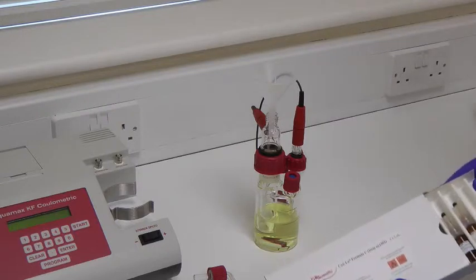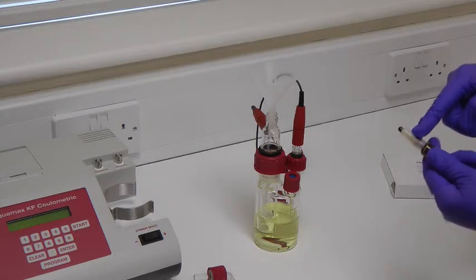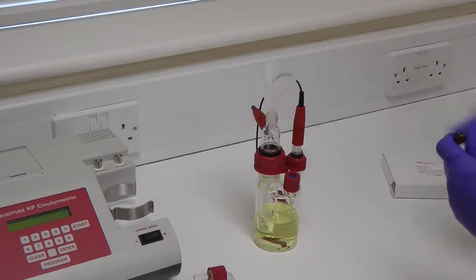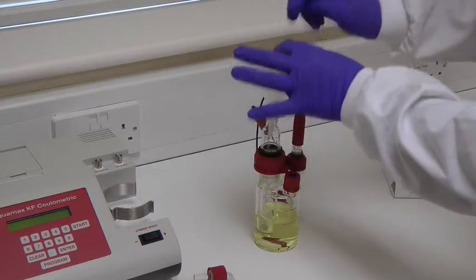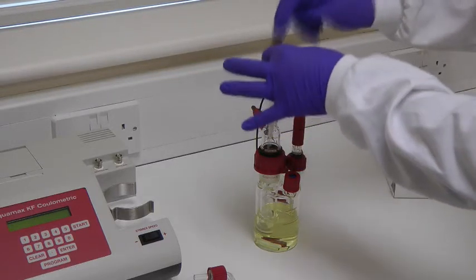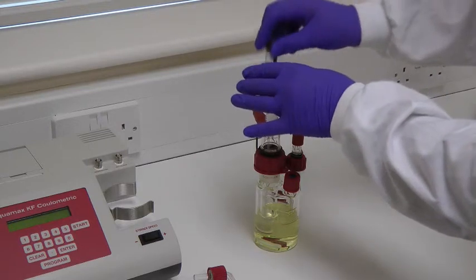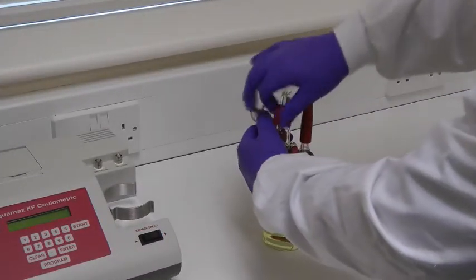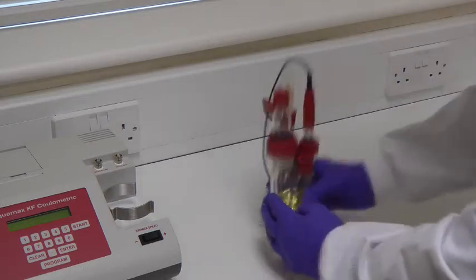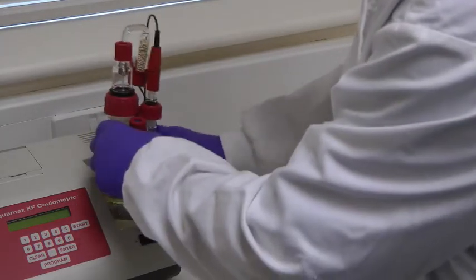Take the cathode reagent, snap the vial, which has a safety snapper already fitted, and pour the reagent into the inner chamber of the generator electrode. Reconnect the drying tube, relocate the glassware onto the Aquamax KF Coulometric, and connect the electrode leads onto the appropriate sockets.